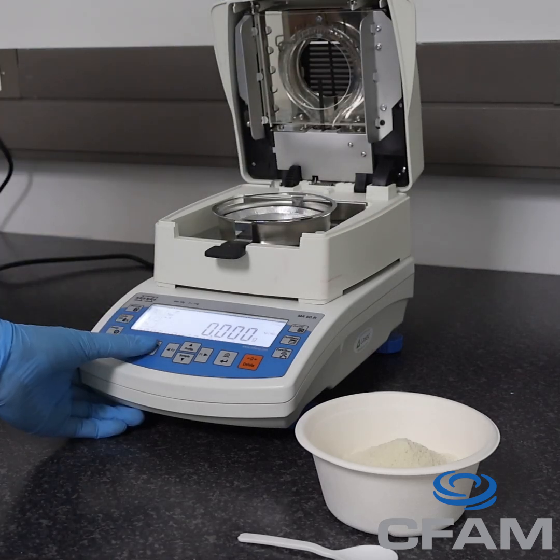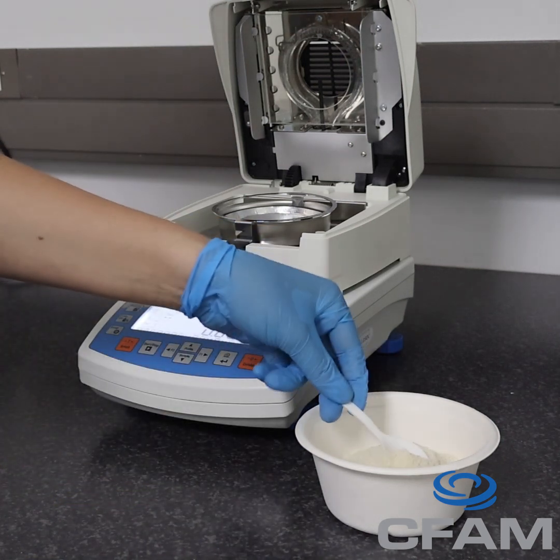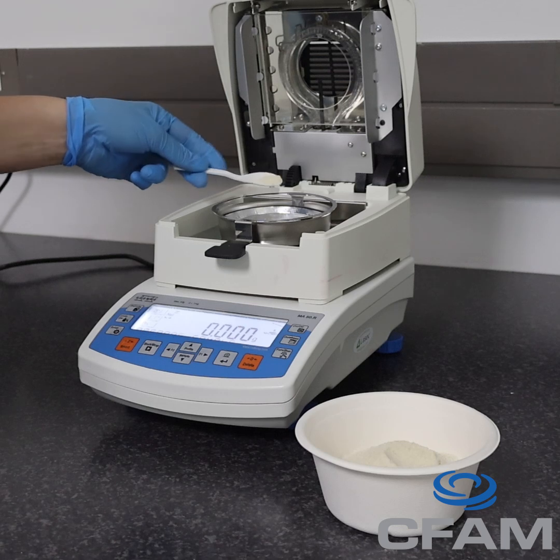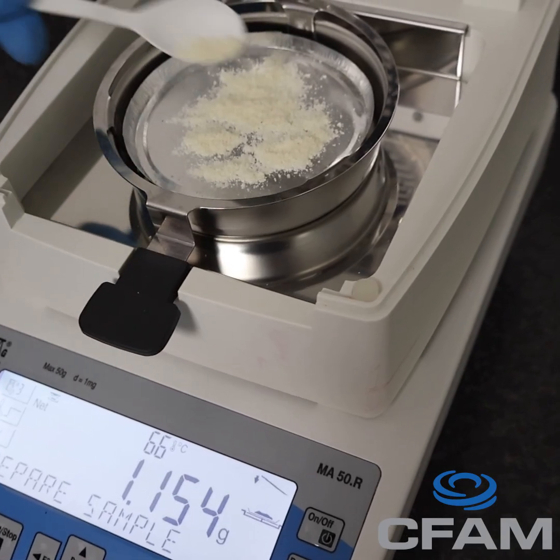The moisture analyzer is used to measure the percentage of water in a food sample. Moisture content plays a critical role in product development. It affects texture, shelf life, and how ingredients behave in the extruder.